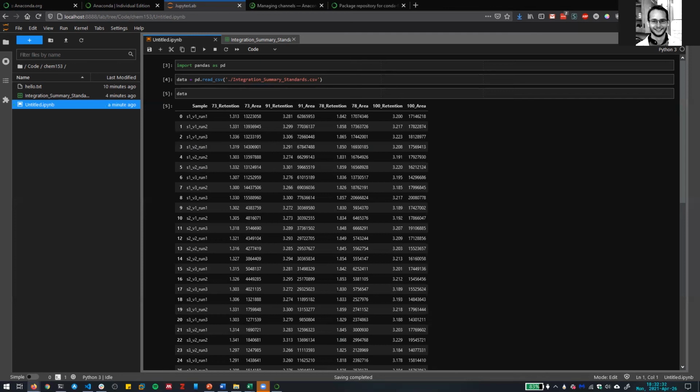We're not going to be doing most of the features that GitHub has that make it so useful, but I am going to be using it to give you guys some pre-built Jupyter notebooks and some data files and code and stuff like that. So for that repository that I just linked to, you should be able to download the code by clicking on the green code download button, and I would recommend just downloading the zip file. Once you do that, you can move it into your repository or the folder that you just made, and then we can extract it there.